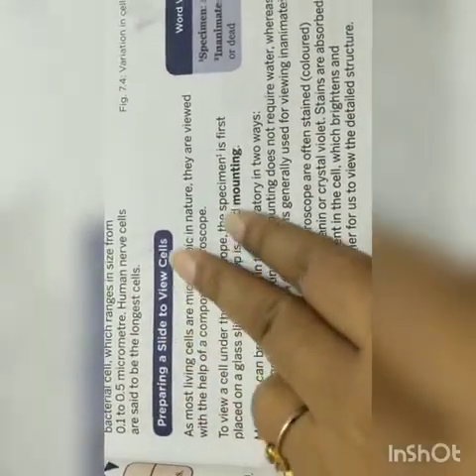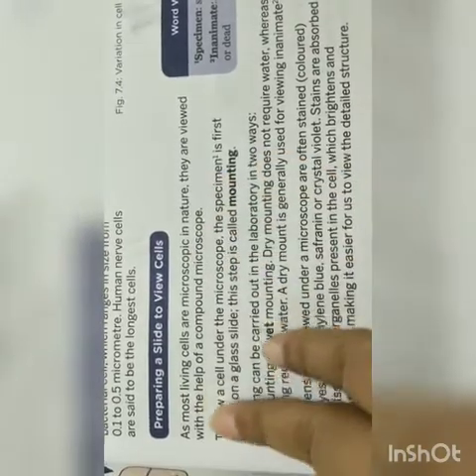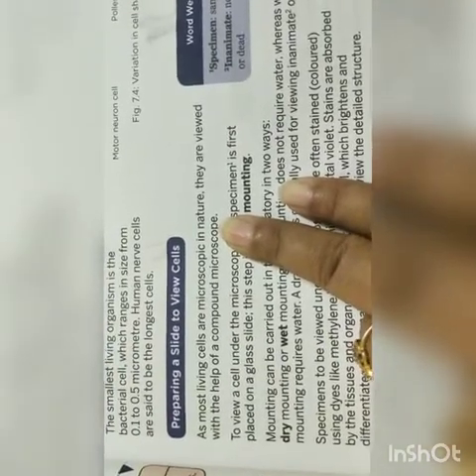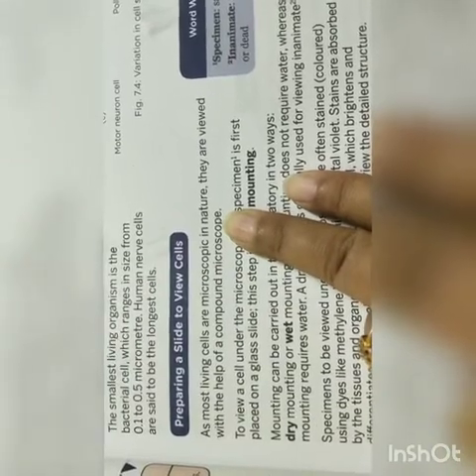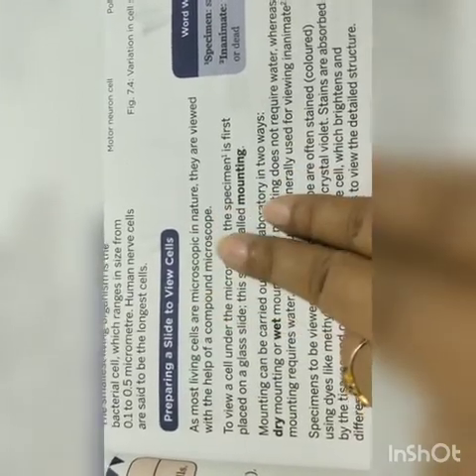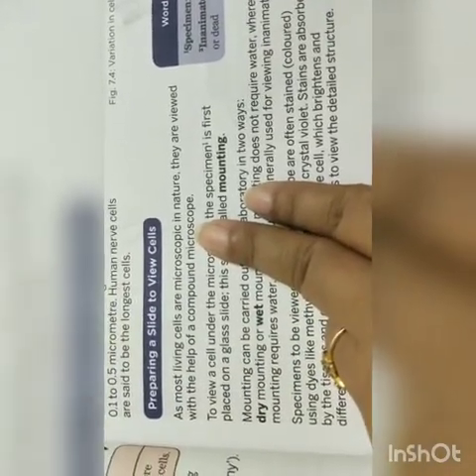Preparing a slide to view cells. As most living cells are microscopic in nature, they are viewed with the help of a compound microscope. So all of you know that all the cells in living organisms are what? Microscopic. Microscopic means we cannot see them with our naked eye. Only with the help of a compound microscope are we able to view their structures, shape and size.